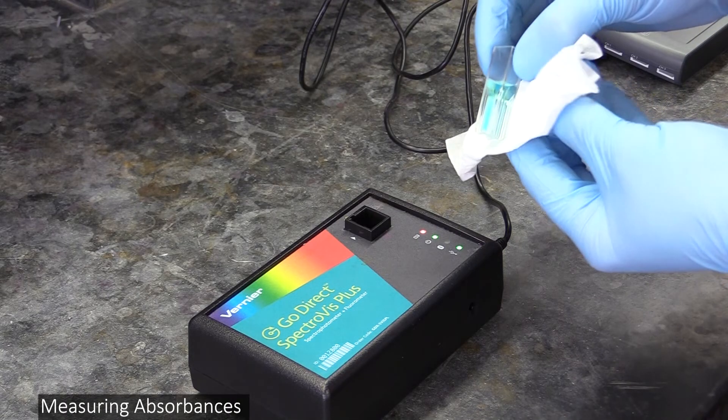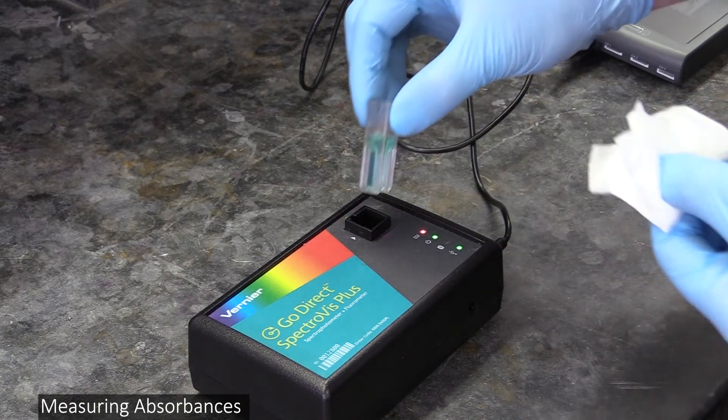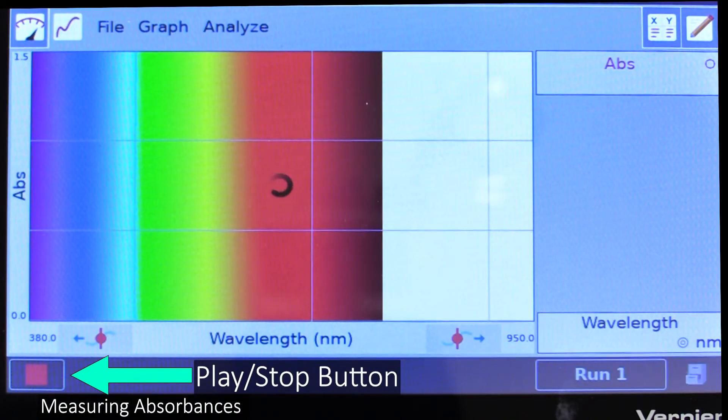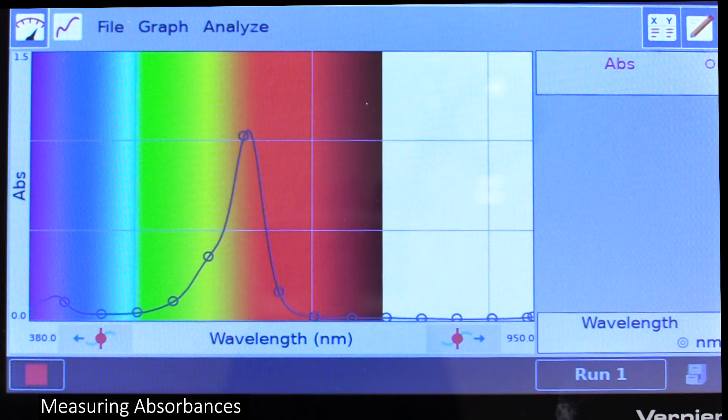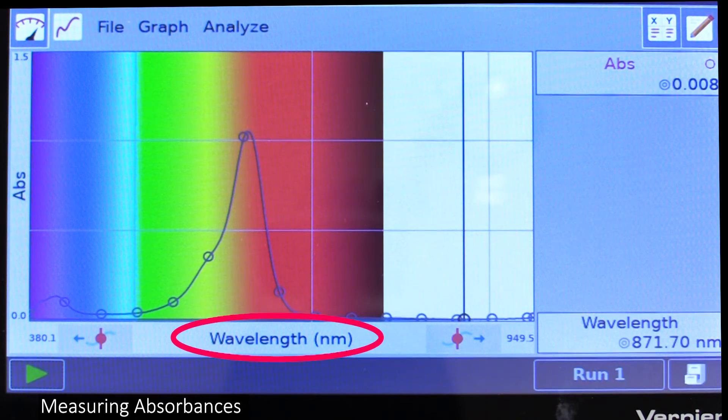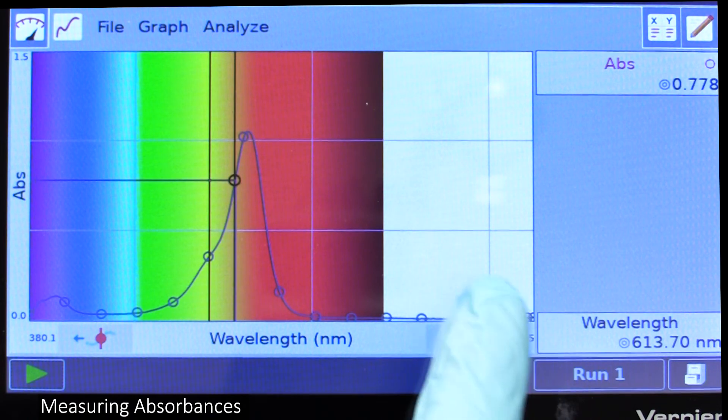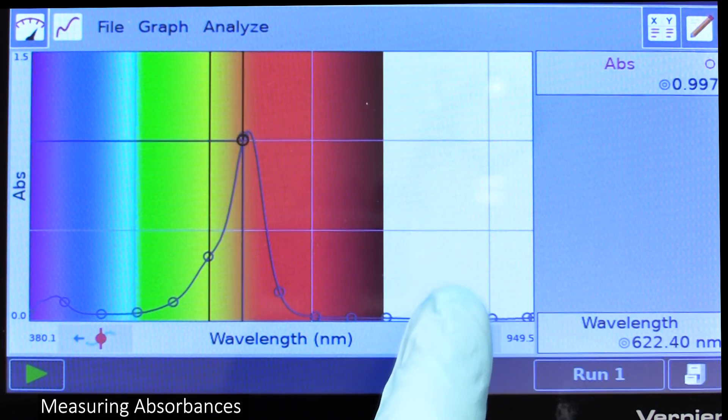Now it's time to analyze a solution. Start by filling a cuvette with solution, put it in the sample holder, and press the play button on the computer screen. Give it a second to finish the reading, then press stop. What you'll get is a graph with absorbance on the Y axis and light wavelength on the X. You can check the absorbance at any given point by clicking on a part of the graph or using the keys at the bottom to move back and forth along it.